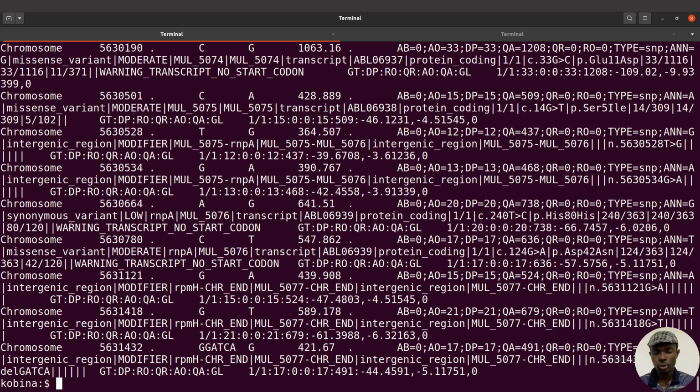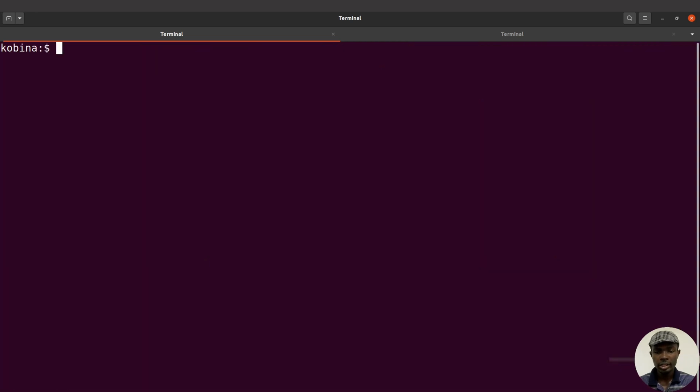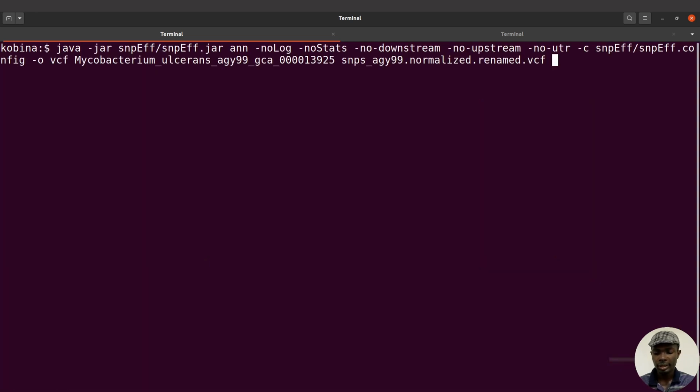Okay, so that is what is missing in the command we are using now. So what we are going to do is to add something else so that the output here is directed to an output file to be specific. So let's clear the screen, and then let's recall the command, and this time let's add this, and then let's proceed. So I'll add an output file here.